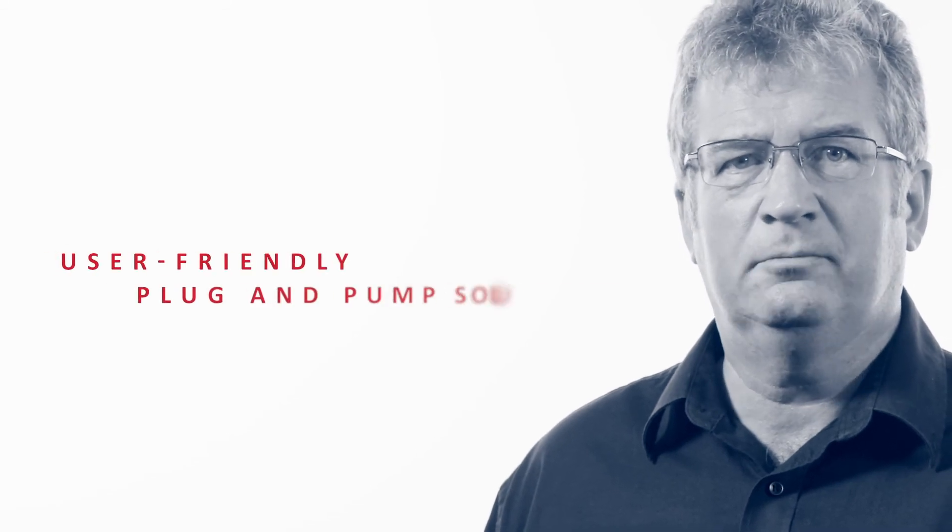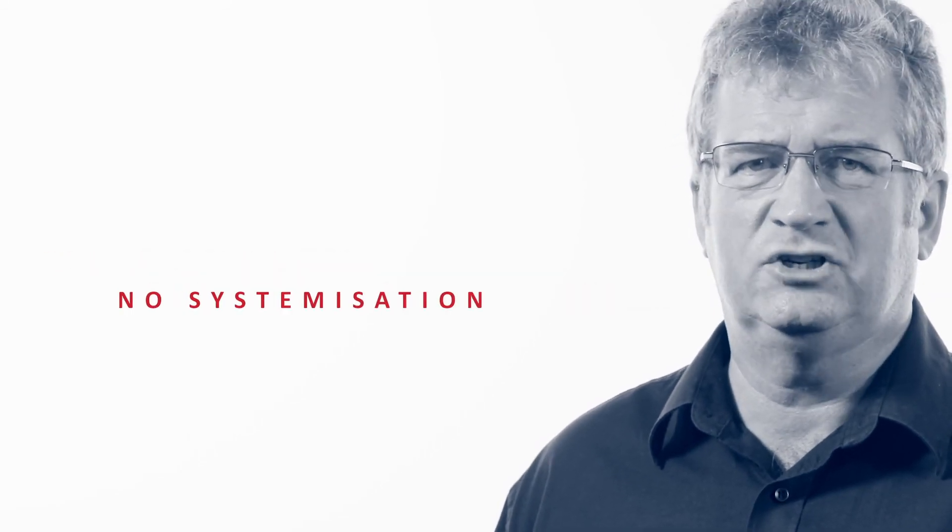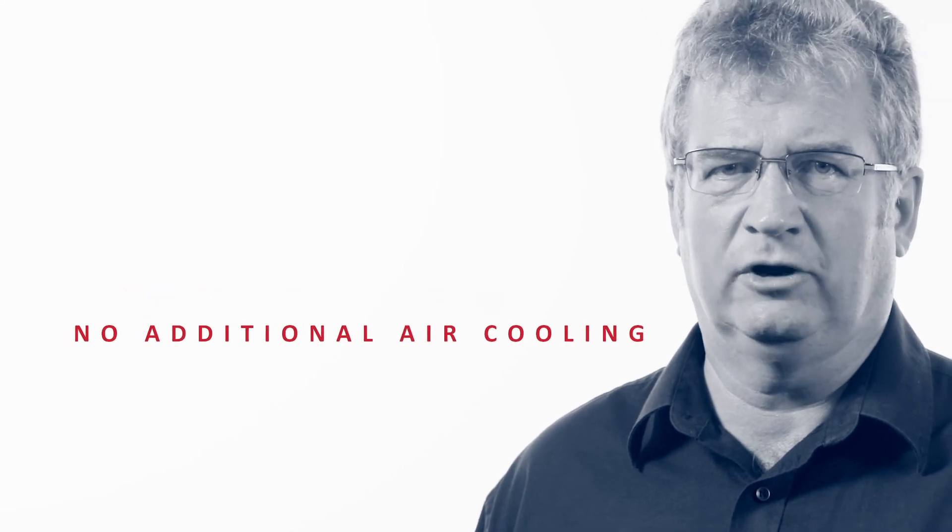This is a simple user-friendly plug and pump solution with no systemization and no additional air cooling required.